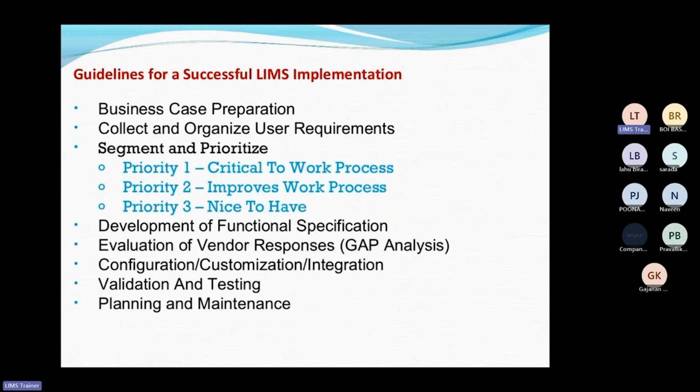Whether you are in an implementation role, an end user role, stability management, or inventory management, whatever different modules are there inside the LIMS software, I will explain in further classes. That will help you in any kind of interview related to LIMS.